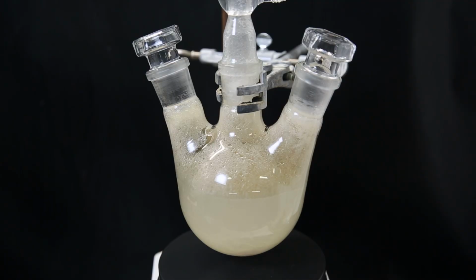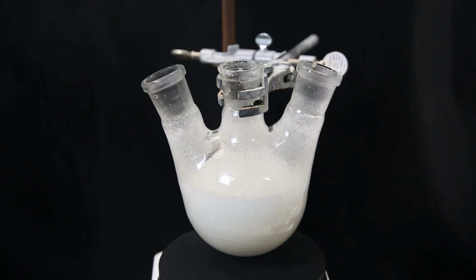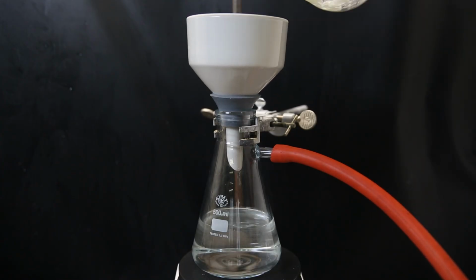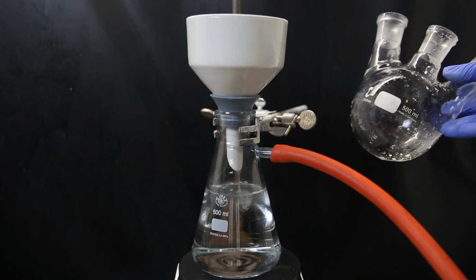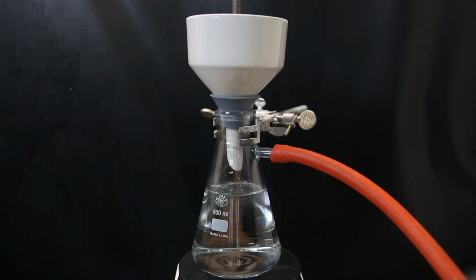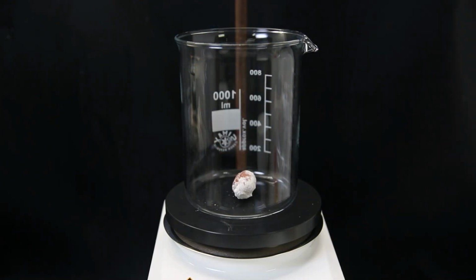Very boring. So I wait for it to cool down and solidify. When that happens, the product has become the desired white solid, and I can filter it out. So I set the well-behaved product up for vacuum filtration, and I filtered it all through with some extra water. And it all came out of the flask cleanly, unlike that stuff from before. We have some nice white crystals on the filter, and I dump it all into a beaker.